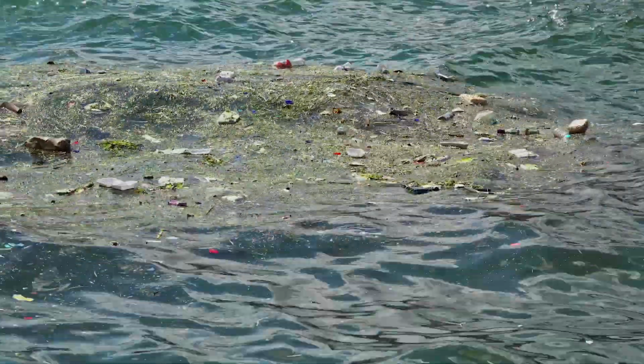So if you have poor results, think back to your visual observation, or look around the environment and even upstream to see what could be causing the problem. Once you eliminate those contaminants, nature will start repairing itself, and if you keep testing the water quality, it should revert back to a normal range. We have a responsibility to balance the needs of humans and making sure our impacts aren't negatively affecting our aquatic environment.